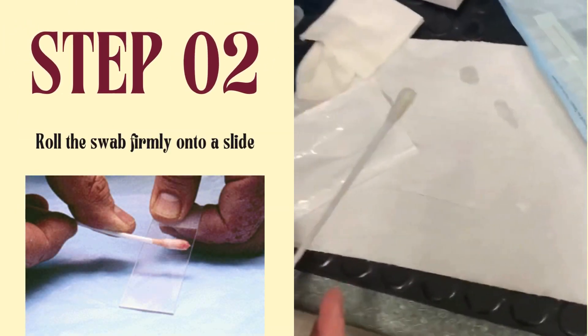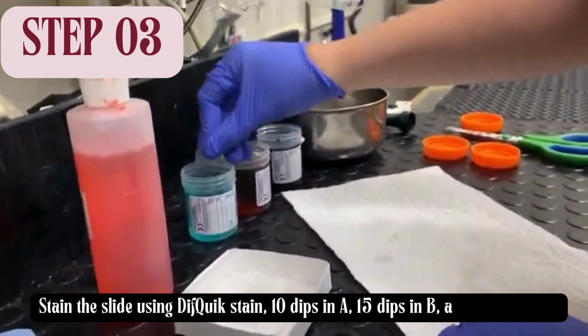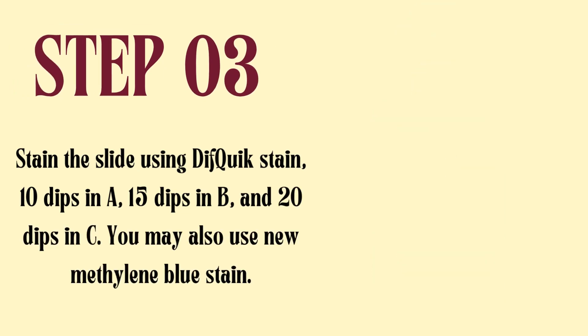Step 2: Roll the swab firmly onto a slide. Step 3: Stain the slide using Diff-Quick stain — 10 dips in A, 15 dips in B, and 20 dips in C. You may also use new methylene blue stain.